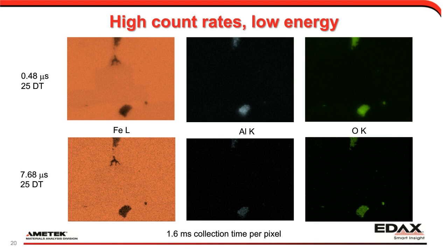This is probably holes in the sample and me not being careful enough to clean out all the polishing compounds, which is typically alumina. But we can see the inclusions quite clearly. If you compare the iron map, you can see the slight gradient in the concentration seen in the middle of the map is not as clear at the 7.68 microsecond statistics.